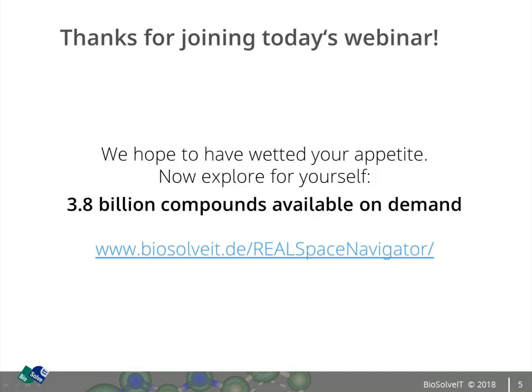Imagine we have a new amine, and we would like to see whether it's a high score or low score. So basically, we take it and test it in 20 common reactions, let's say acylation, some reductive amination, etc. And if we, for example, see that the success score for this building block is low, let's say less than 70%, we either test it with the building block in different reaction procedures, because for reductive amination reaction we have at least 4 of them established.